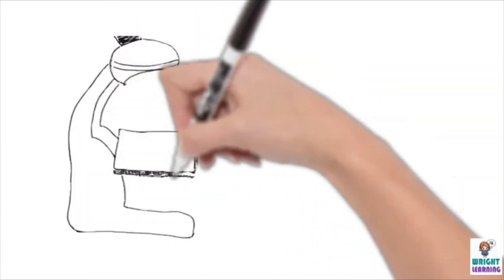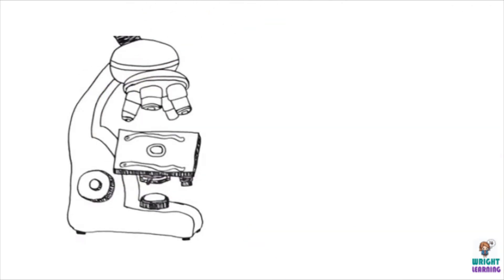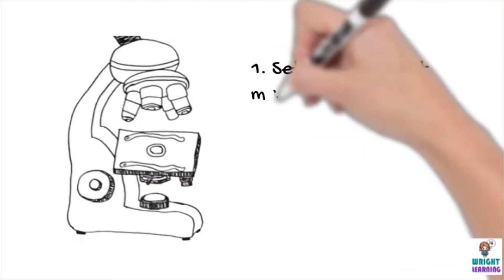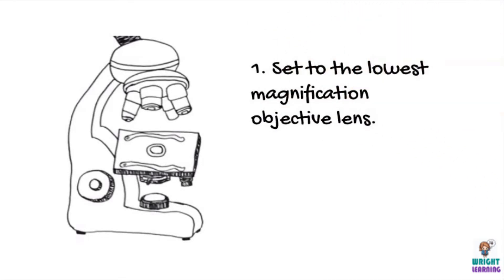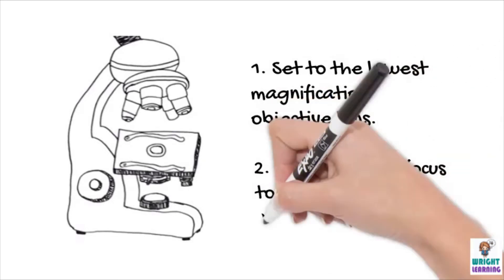To focus your light microscope, set the microscope to view your sample using the lowest magnification objective lens. This is the shortest lens, and is usually red. Then, use the coarse focus dial to bring the stage all the way up before you start focusing.